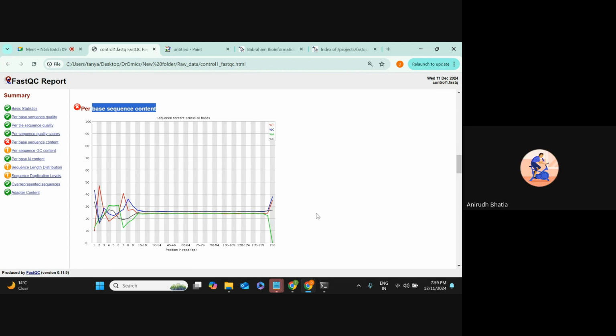Okay. So where does the bias come from in our data? Is there a reason for that? Yeah. We will discuss this bias during the quality filtering, sir, in detail. Maybe in the wet lab, whenever people are doing over-amplification in the PCR step, right? Sometimes because of that also, you can get that bias. And there are a lot of other reasons also that we will discuss during the filtering, sir.